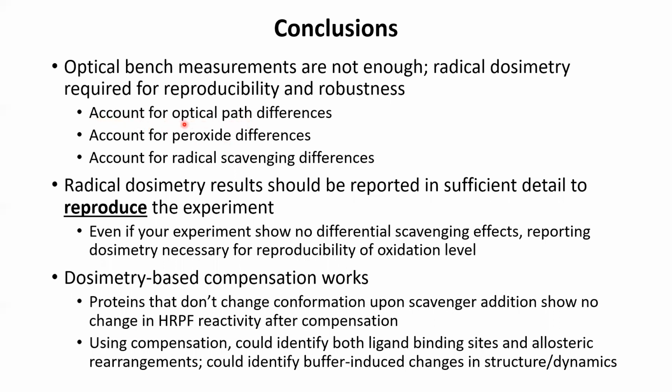Additionally, your optical path. If you remember looking back at our optical bench, this isn't a highly engineered, carefully graded optical bench, right? This is something that we have assembled ourselves. These are not high quality, delicately engineered photochemical cells. We're using a piece of fused silica that we've burned the coating off of, okay?